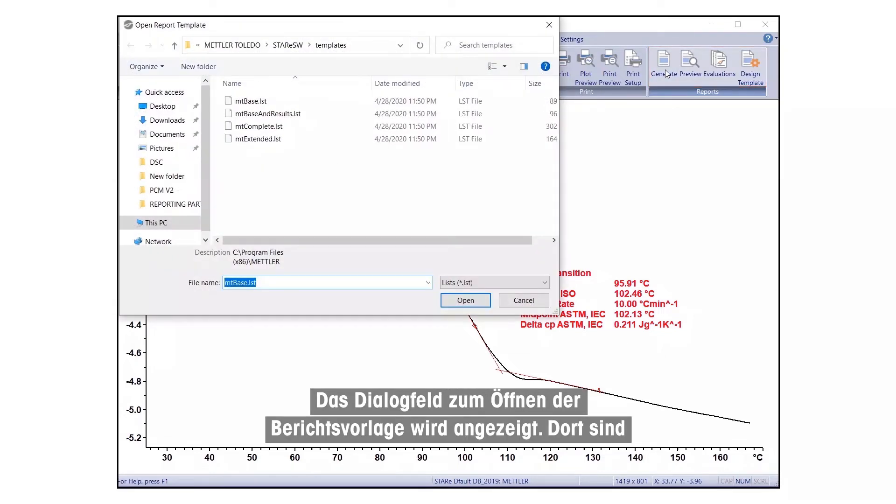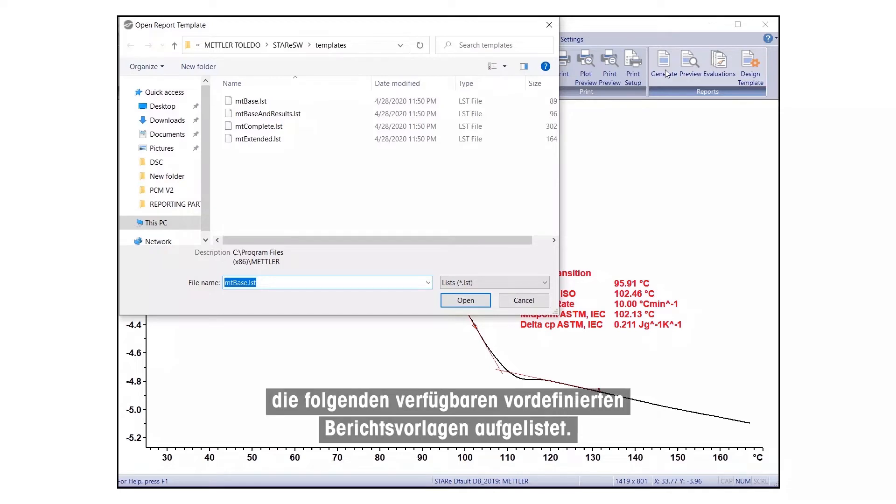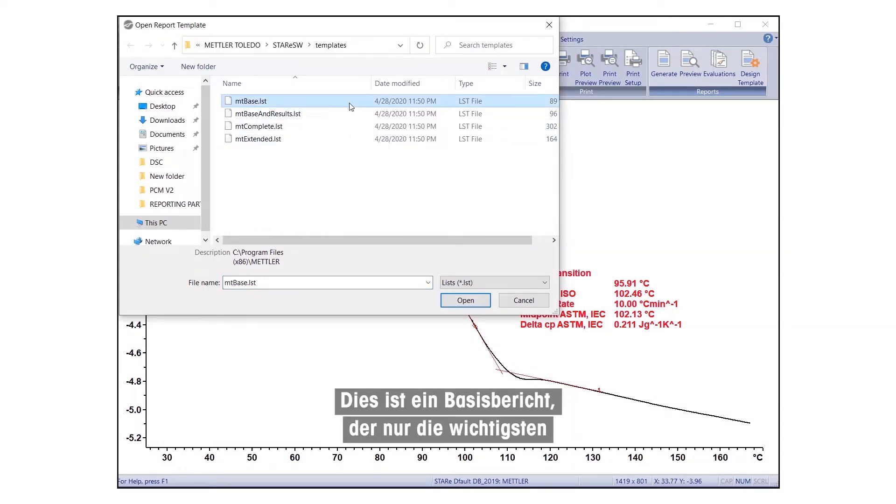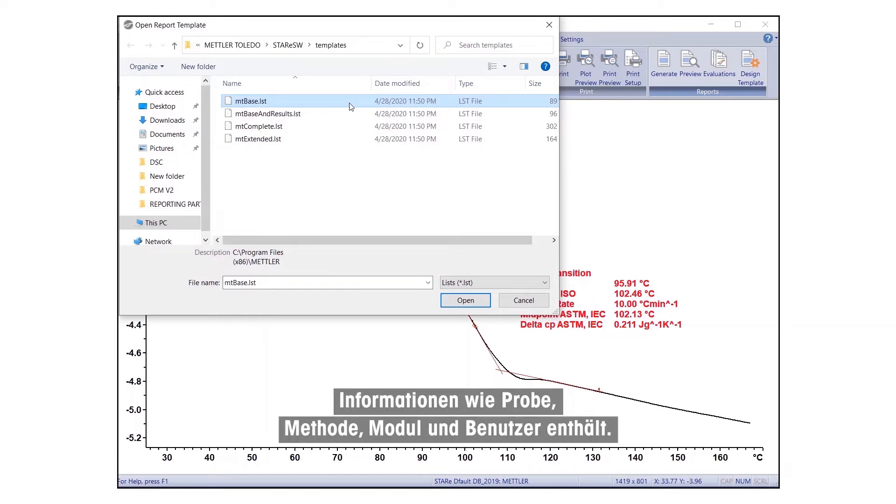The Open Report Template dialog box will appear, listing the following available predefined report templates. One, MT-Base. This is a basic report including only the most important information, such as sample, method, module, and user.